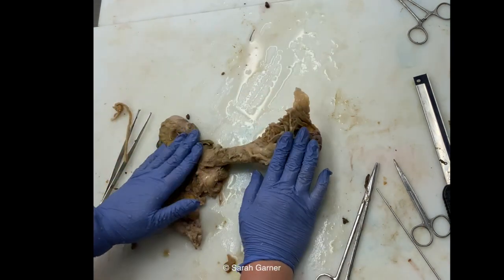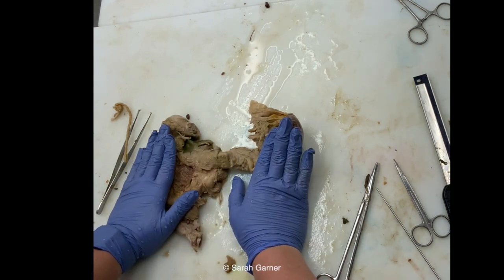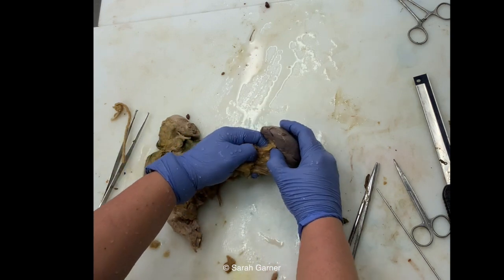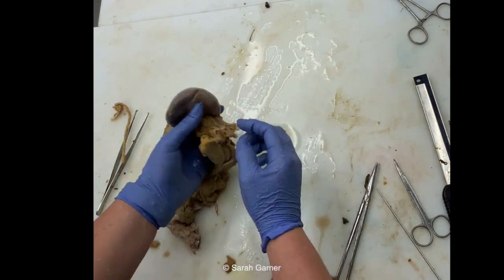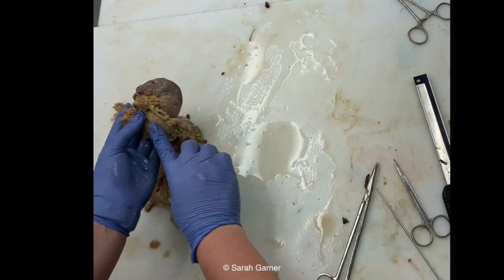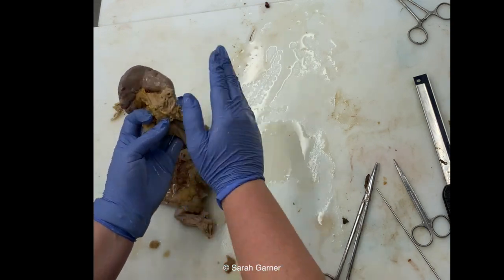So with your pancreas and your spleen, you're essentially just going to serially section them, okay? So with that, you can just remove the spleen unless you're looking for something in the vessels, in which case, remember your splenic vein is going to be just kind of posterior to the pancreas, and then your splenic artery is going to be just superior to that.